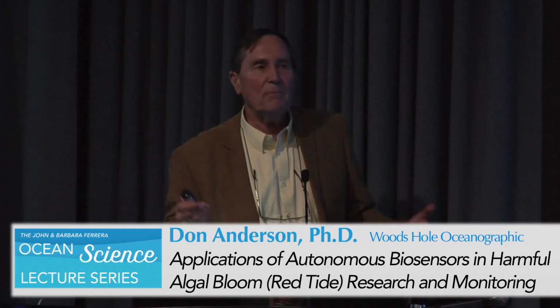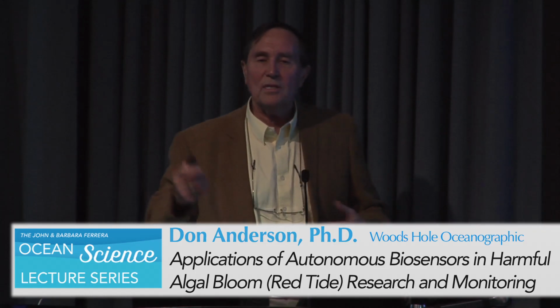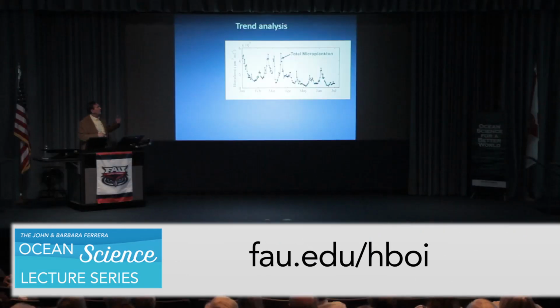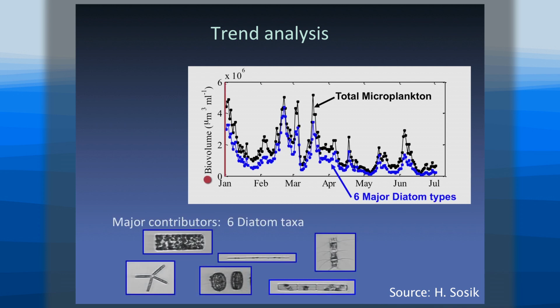But I know some people here might also be interested in climate change and changes in pollution. Can you clean up the Indian River? So I stuck in a few slides here about what we might call trend analysis. Let's look over long periods of time. What can this instrument give us? So here's an example. Think of this as cell number. It says biovolume, but it's the same thing.